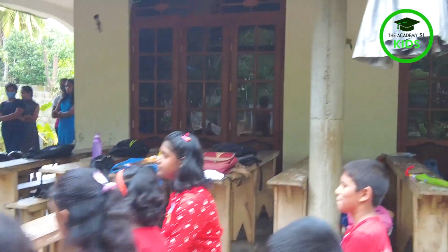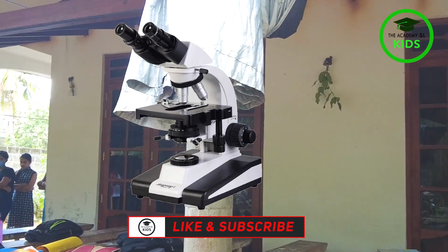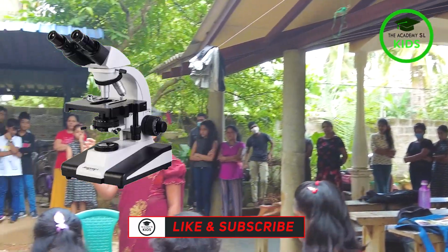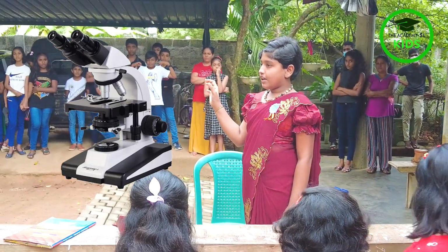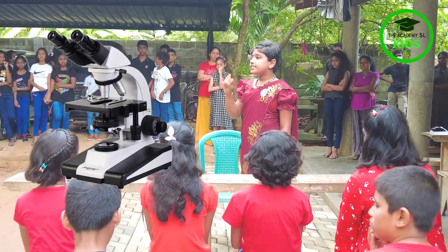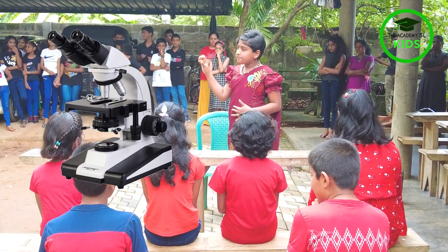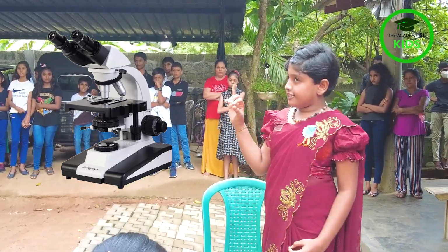The first part is the eyepiece, and here it has used a convex lens. This is the body tube. The function of the body tube is to connect these eyepieces and these objective lenses. Here we have two knobs. The large knob is called coarse adjustment, and the small knob is called fine adjustment.